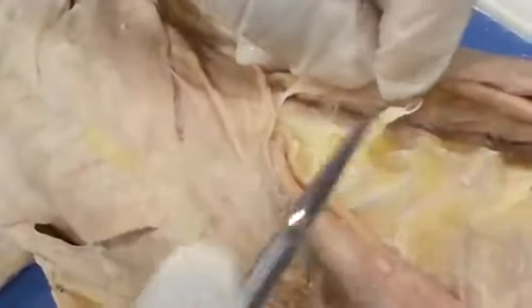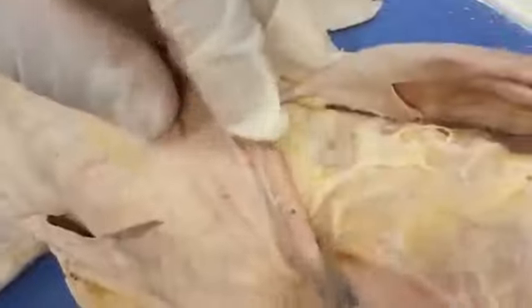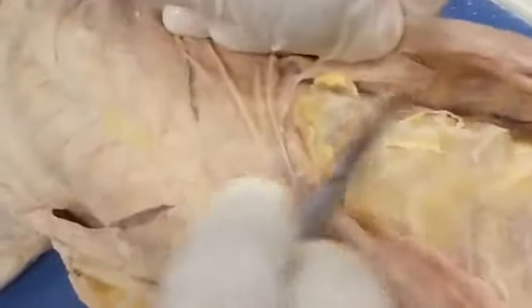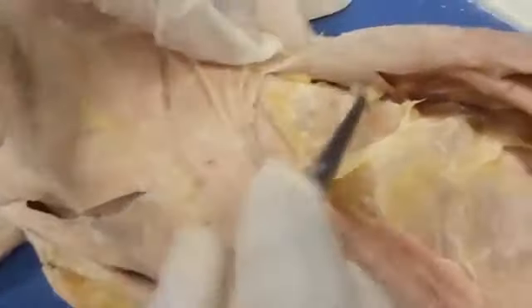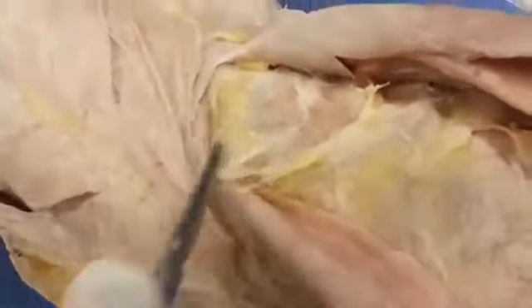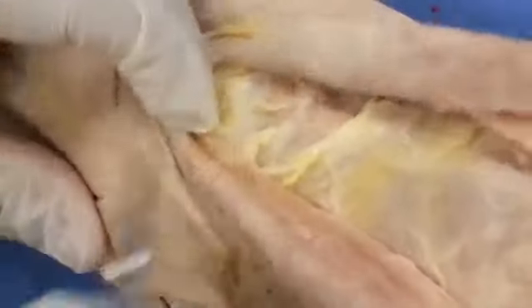And since we're already here and it's kind of visible, not too visible, but enough for you to get an idea, these are going to be the external intercostals. So you get a good view of the external intercostals there. Now as we make our way anterior, you would see a border with the internal intercostals.